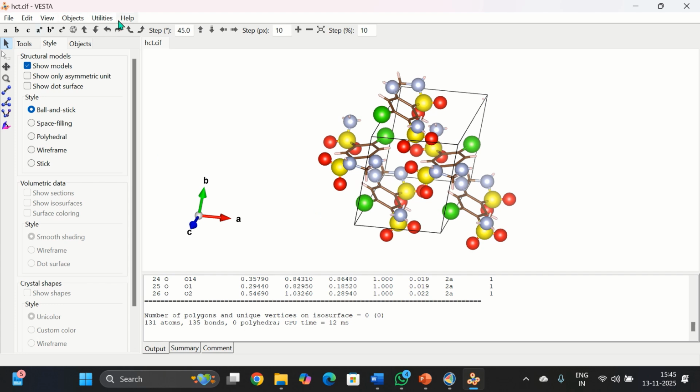So to easily get the powder diffraction pattern that the structure we have created should have, and for its comparison to the actual PXRD pattern that we obtain from the synthesized solid molecules, we can see the degree of correspondence between those two, how much they match, and whether we crystallized the required compound or not in the solid form.